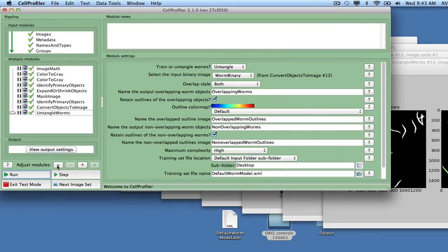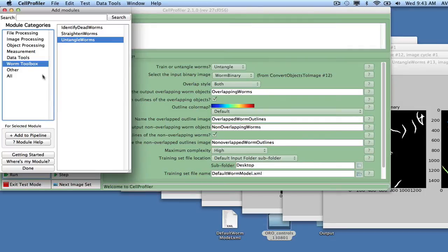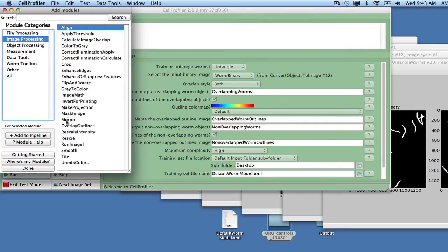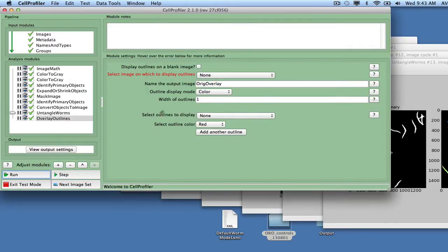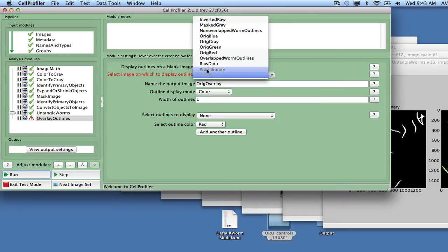As a sanity check of the result, use Overlay Outlines to overlay the worm outlines on the original raw data image. Select the two outlines and call the output image Ridge Overlay.